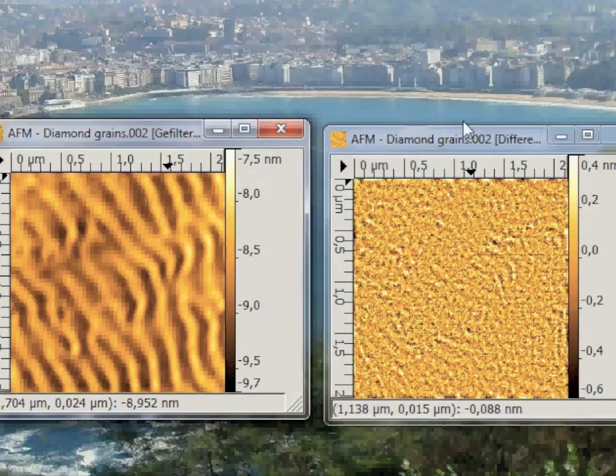These are the waves. This is the back transformation of the central part of the Fourier image. And on the right you see the roughness of the AFM image, which was generated by the back transformation of the outer parts of the Fourier image.